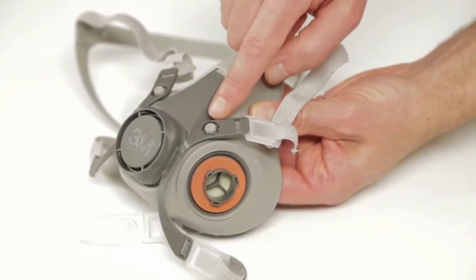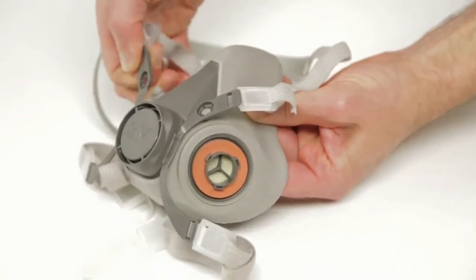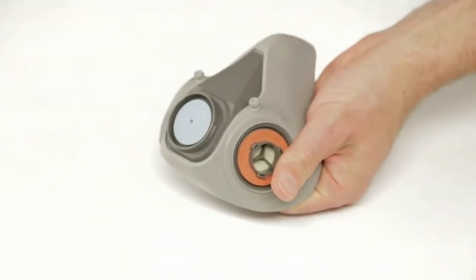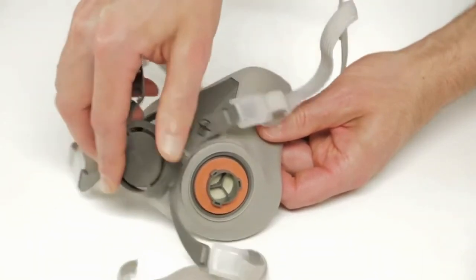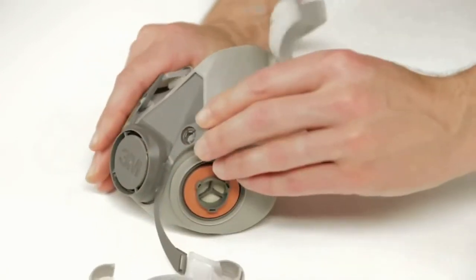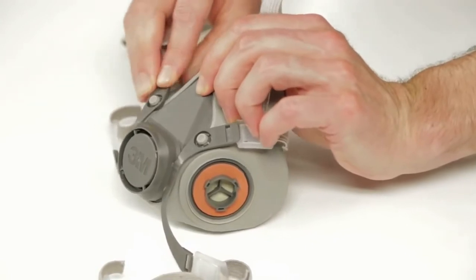To remove the respirator strap assembly, pull the upper legs from the facepiece buttons. Pry the valve cover assembly from the facepiece exhalation port. To replace the respirator strap assembly, position the valve cover over the facepiece exhalation port and press firmly to snap it into place. Push the upper legs onto the facepiece buttons.